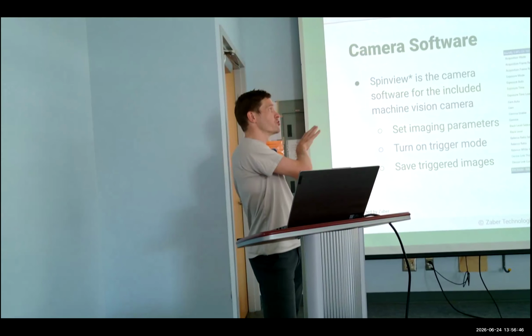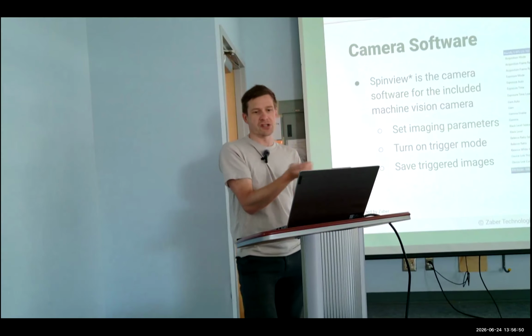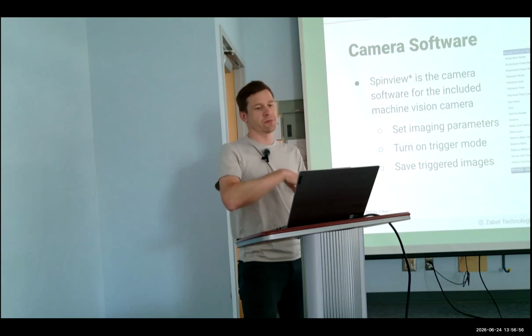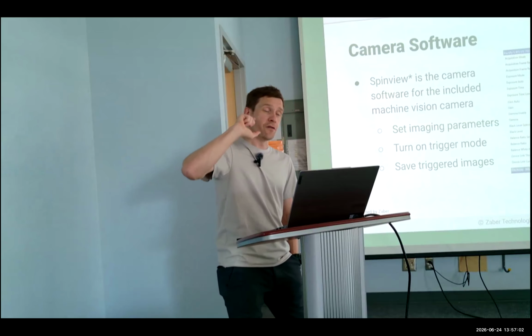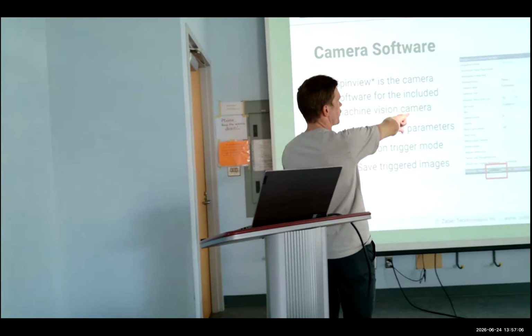We don't have camera control integrated, so we're camera agnostic. I'm just leaving a little basic camera here. The trick with that is, the software will all be set up on the PC, but to switch it into automated acquisition, you do have to set up the triggering.